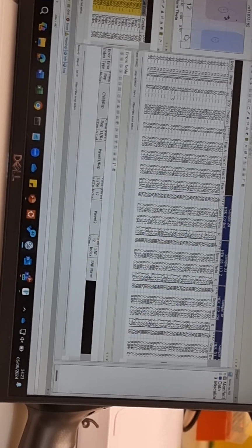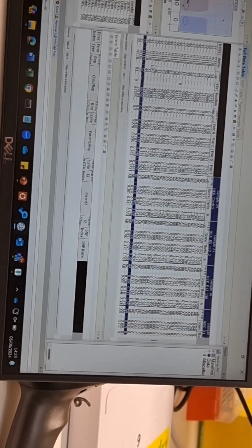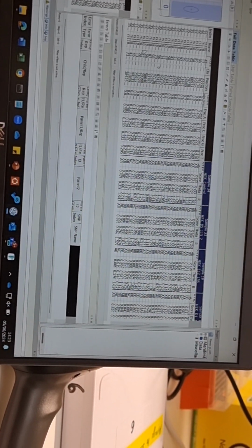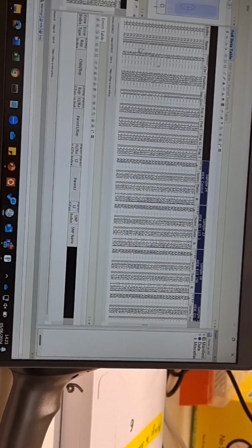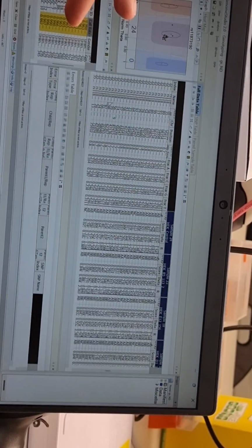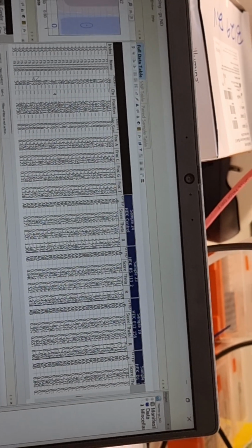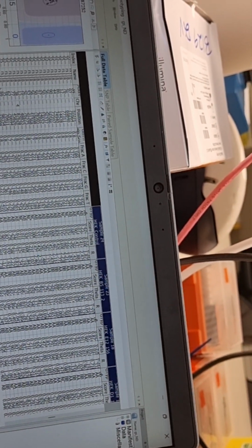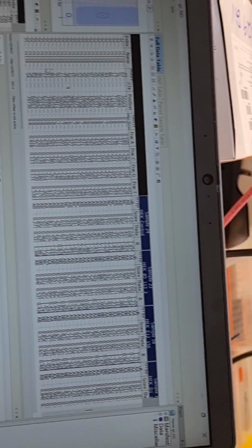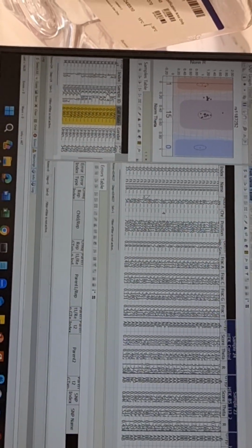Can we eliminate the second line? You can't eliminate them. We would have to create another project. You'd have to recluster them if they were too bad. Can you recluster only the iPS line? The problem with reclustering is it takes about two weeks. You'd have to make a custom cluster file. You can ask it to recluster now, and then you have to go through and check every single one of the SNPs, which is 635,000.